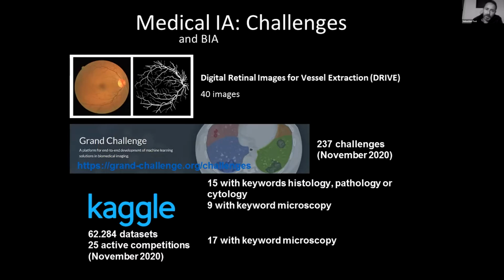There are also some annotated dataset repositories, so I'm showing one here, but mainly it's challenges. And there is a central repository where you can find most of the challenges. It's called Grand Challenge. So today there are 237 challenges. So that's quite many.